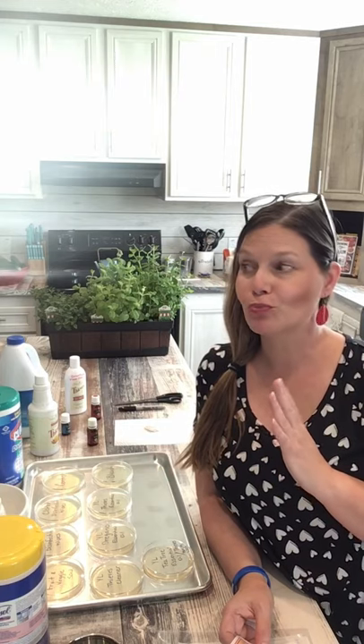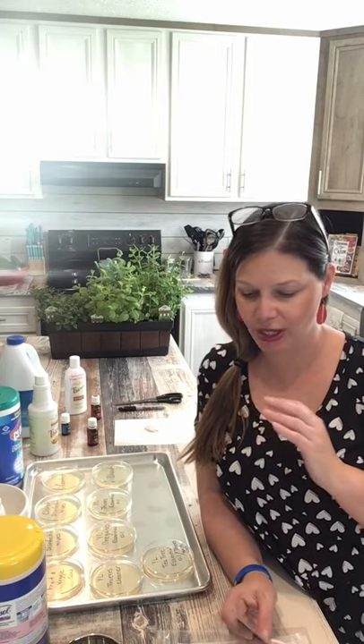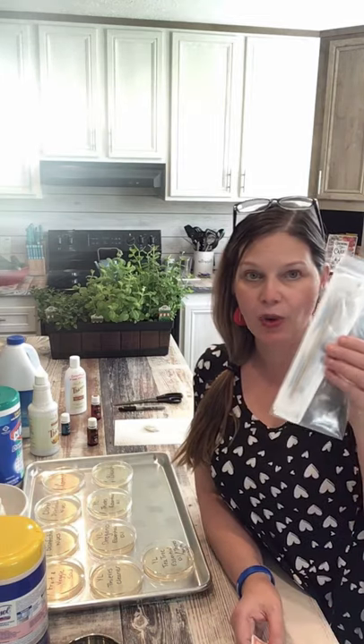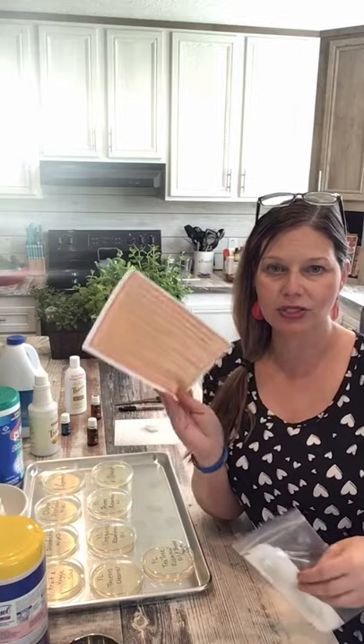Hey guys, okay so what is fixing to go down here is a little experiment. I am going to do an experiment between Thieves and other cleaning products. I bought the kit that contains the petri dishes with the agar already on it. The kit comes with the cotton swabs and the directions on how to do it.